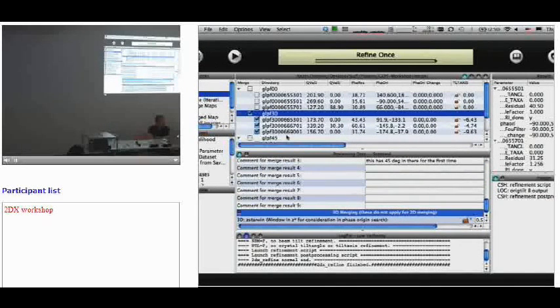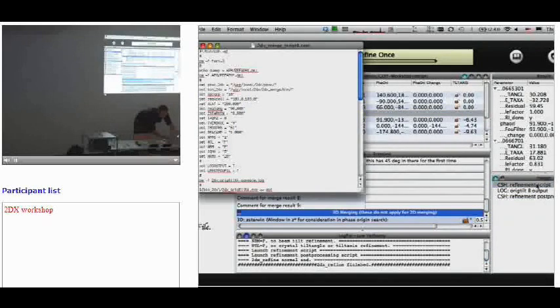Okay, if I now run this, what happens is that it takes our two-dimensional merged data set that we have, and it takes these 30-degree tilted images and refines their phase origins against our 2D reference. So, and that's it. And their phase origins have changed shockingly little. So who knows what happened here? Okay, so you can check that soon.